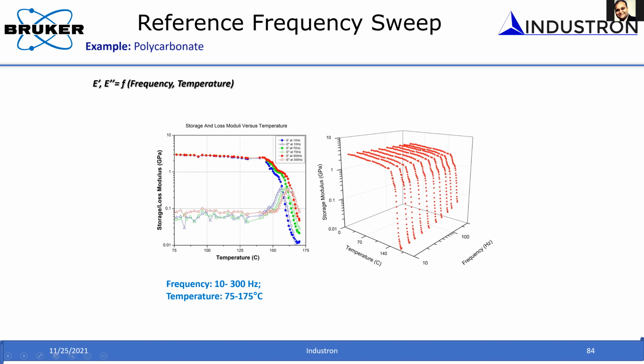Okay, so by measuring the frequency response at different temperatures, we're able to measure the response of this material, and with this we can even construct a time temperature equivalent response on this material. This is very useful for polymer chemists. Okay, now this is another example.